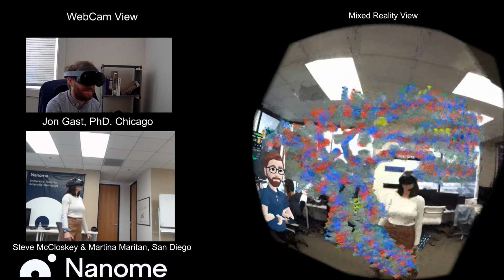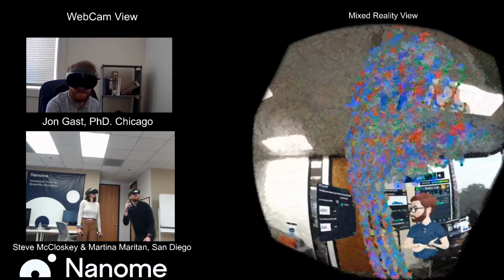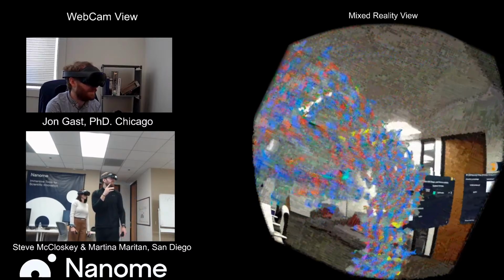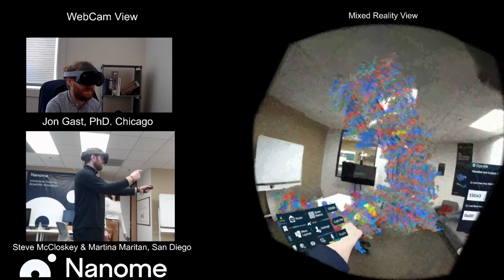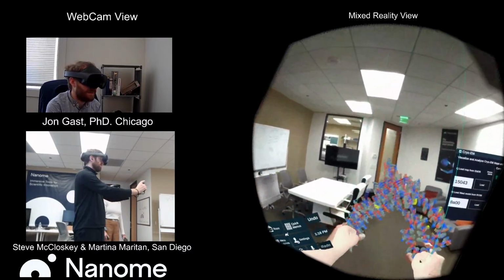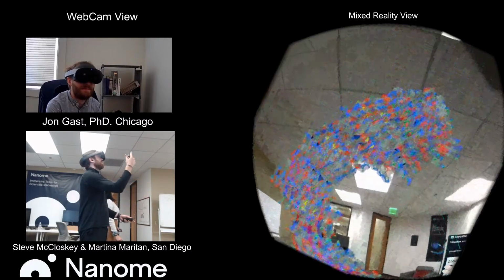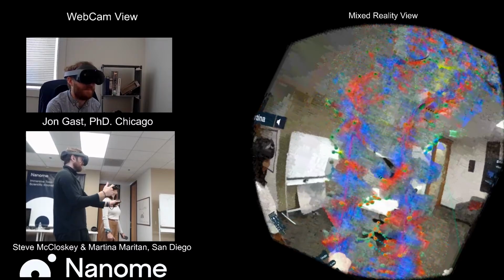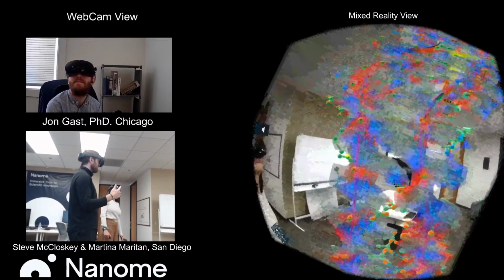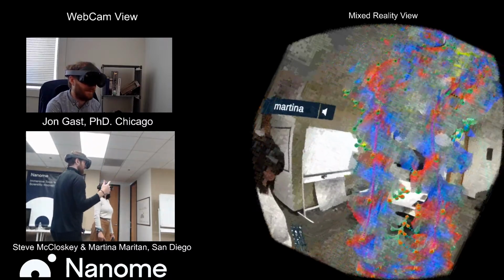And so I have a little bit of limited mobility, but you could walk entirely around the structure. Of course, I like grabbing the structure and having it right in front of me. But if we wanted to make it absolutely big, going even through our ceiling there, we can make it really large, and could even do a bit of a walk around on the structure that way as well.